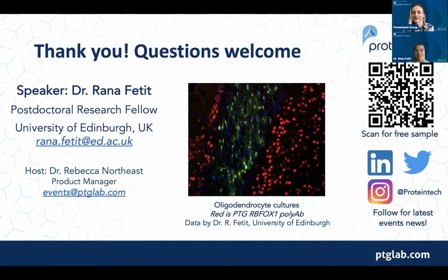And then just a couple more questions, if this is okay. One of them is, how do you get single cells from the spheres? Right, there are different ways to go about that. Some people commonly use Accutase treatment to create a single cell suspension. But with Accutase, you would get very high cell death, so it's not the best way. In our hands, we use the Worthington dissociation protocol, which is a papain-based dissociation system. It takes a bit longer than Accutase, but you get a better yield towards the end. So we follow the papain dissociation system. I guess that is important after 3 months of work to get these.